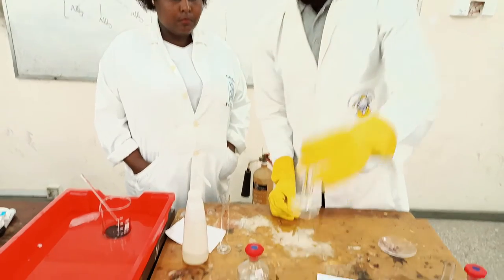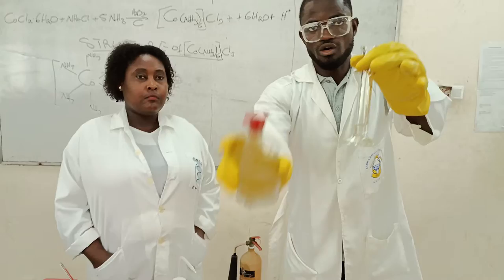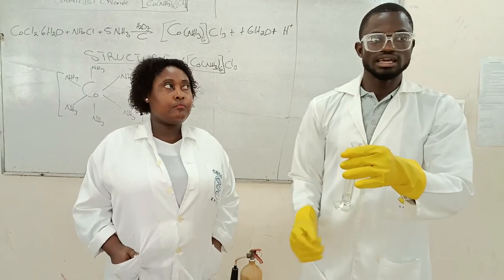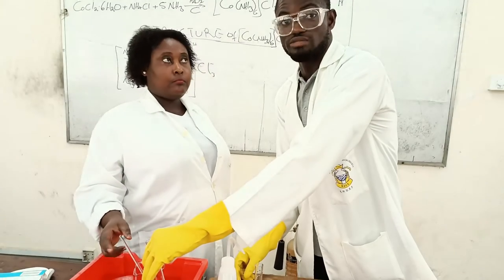We measured 5 mL of ammonia, concentrated ammonia, as you can see. So we're adding it gradually and stirring. Mind you, it's a concentrated base.